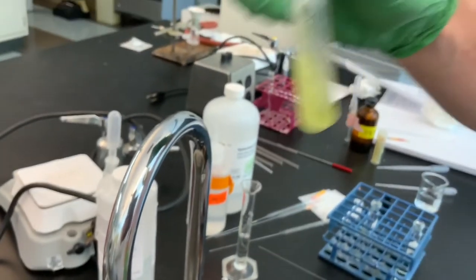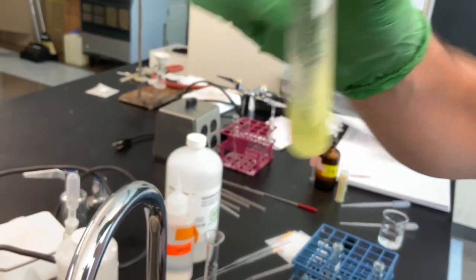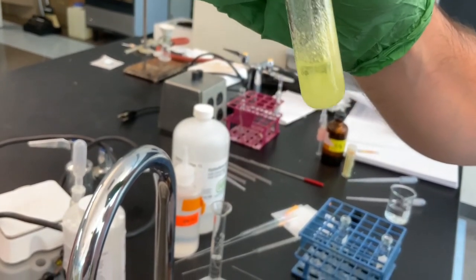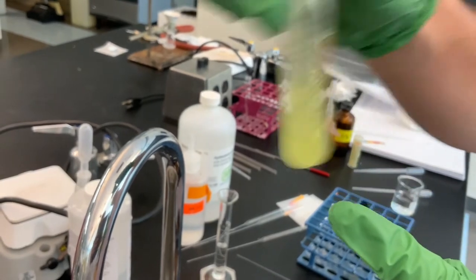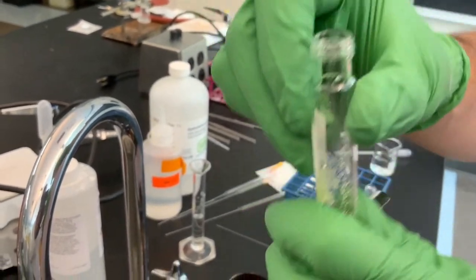Let's check it out. Right, so you see right away that those pieces that were free flowing are stuck, right? They're cemented down essentially into the bottom there. It's rock solid. And on the sides of the glass, it's not even moving. So let's add a little bit more.